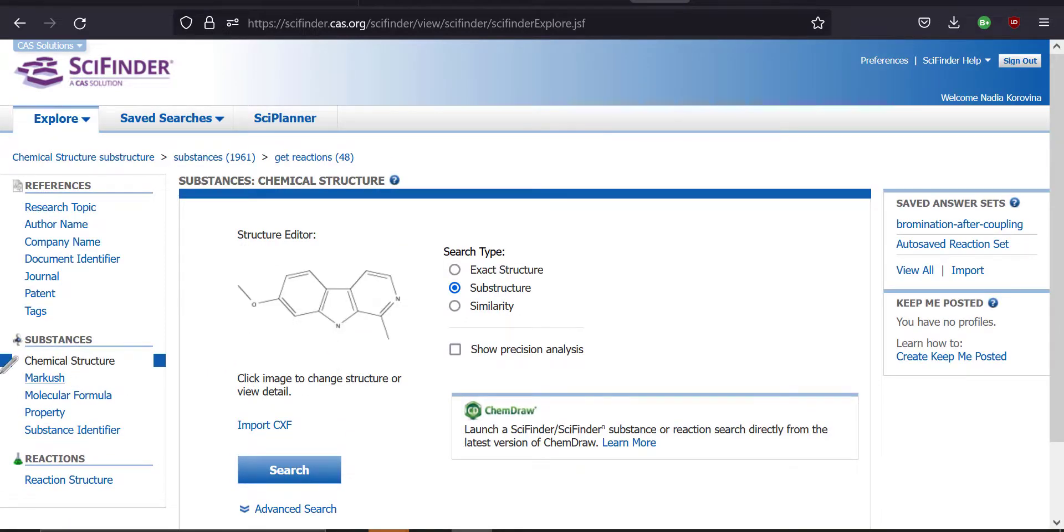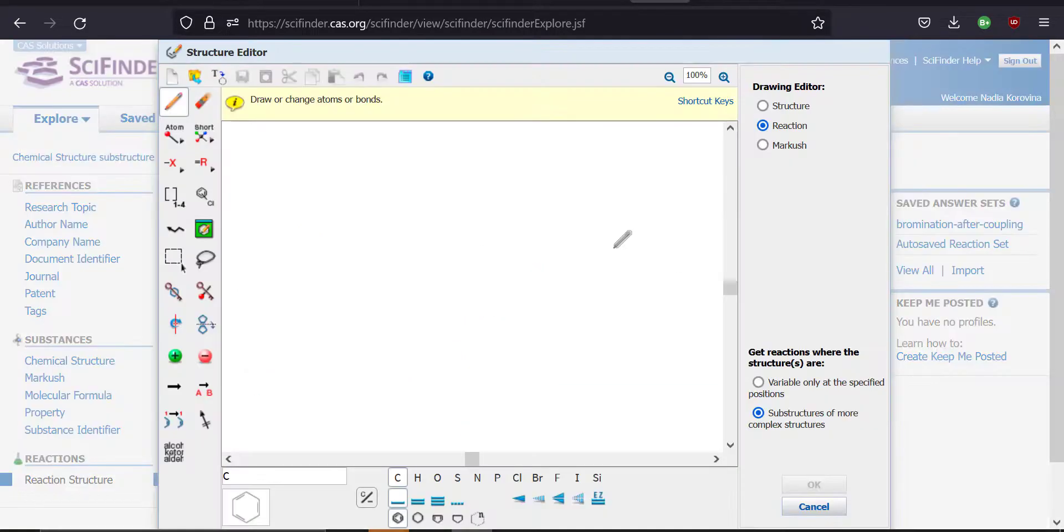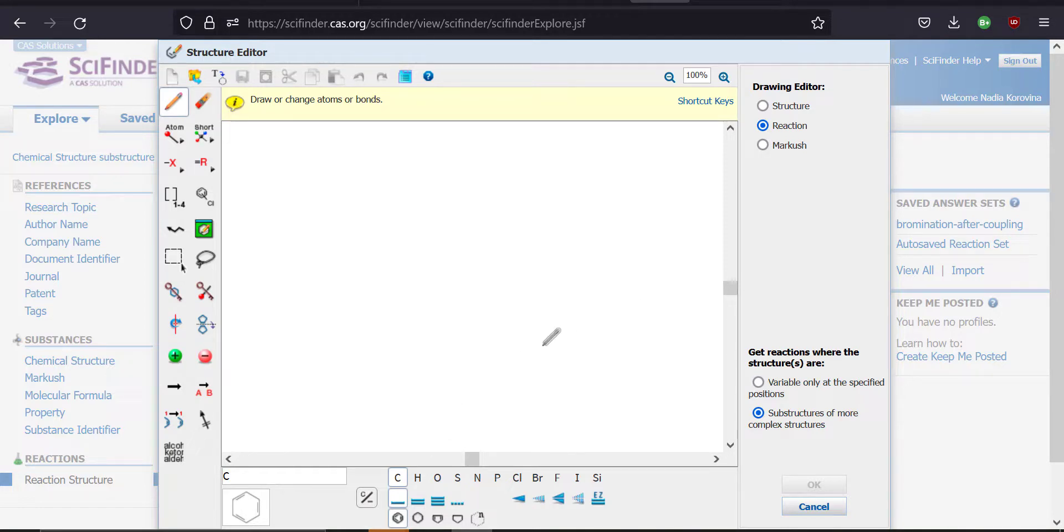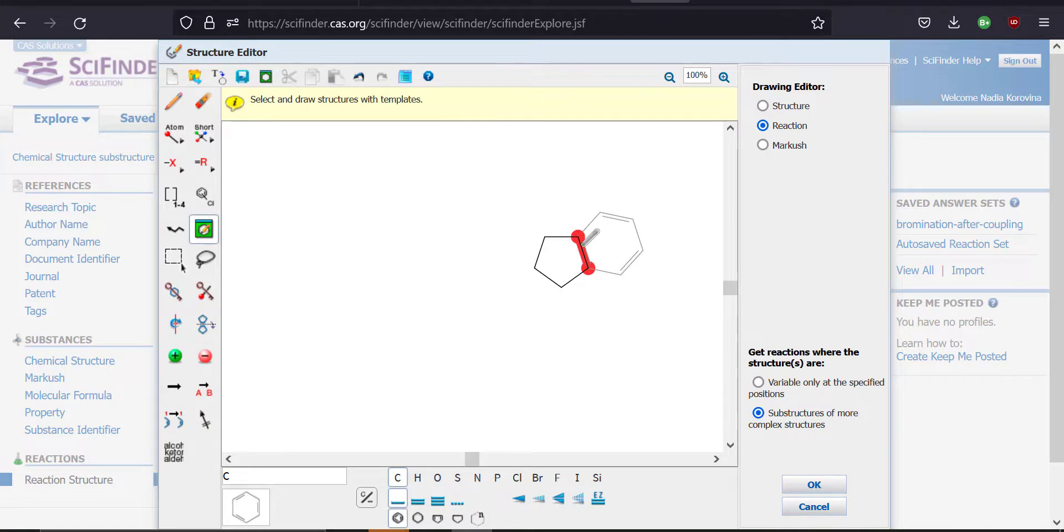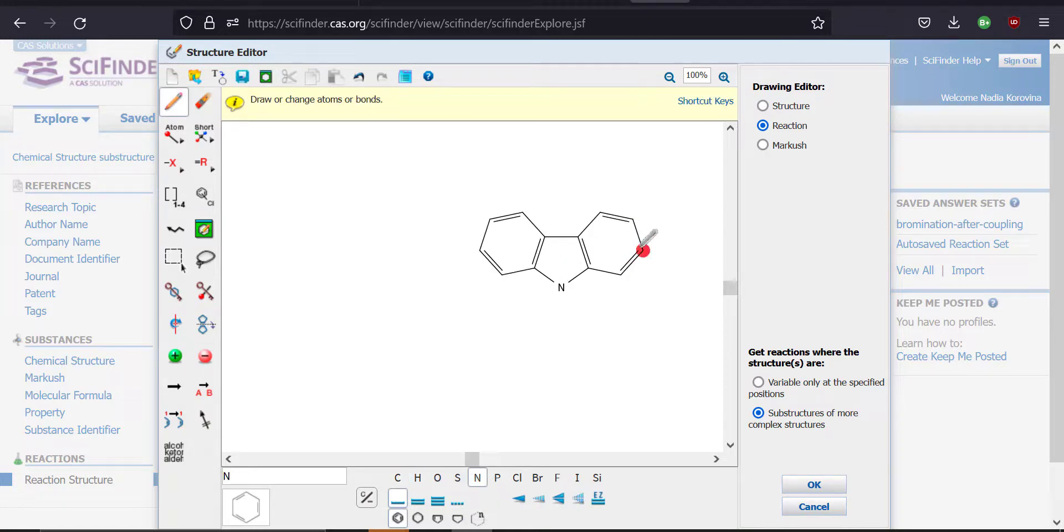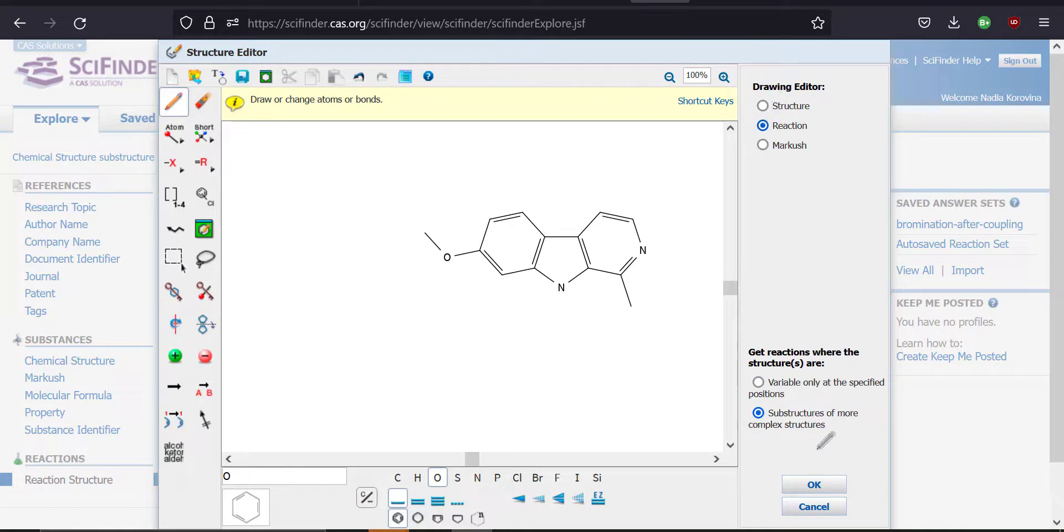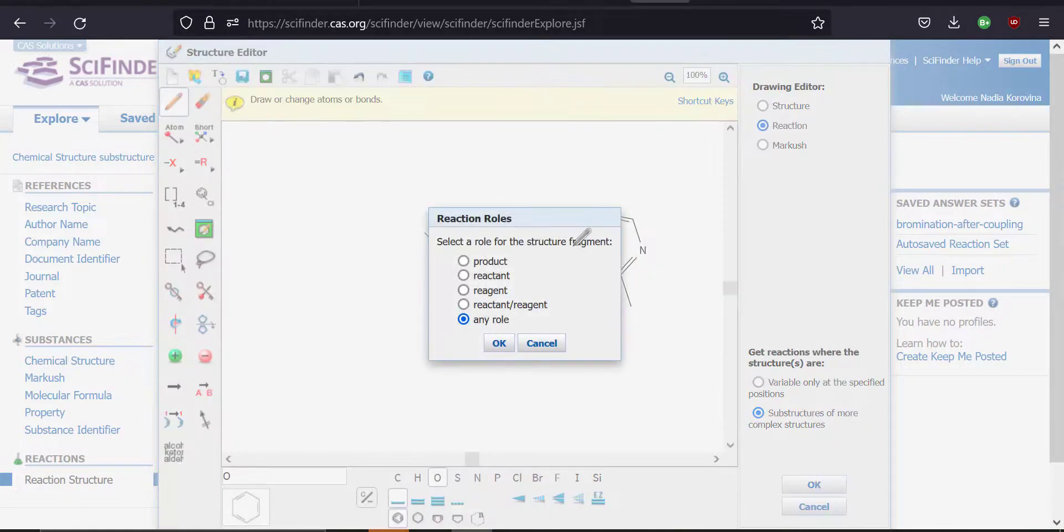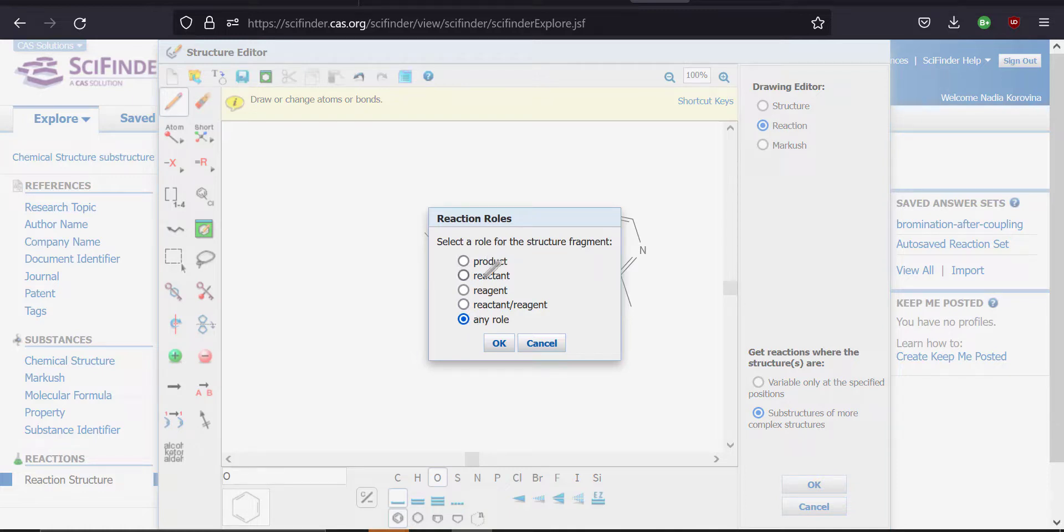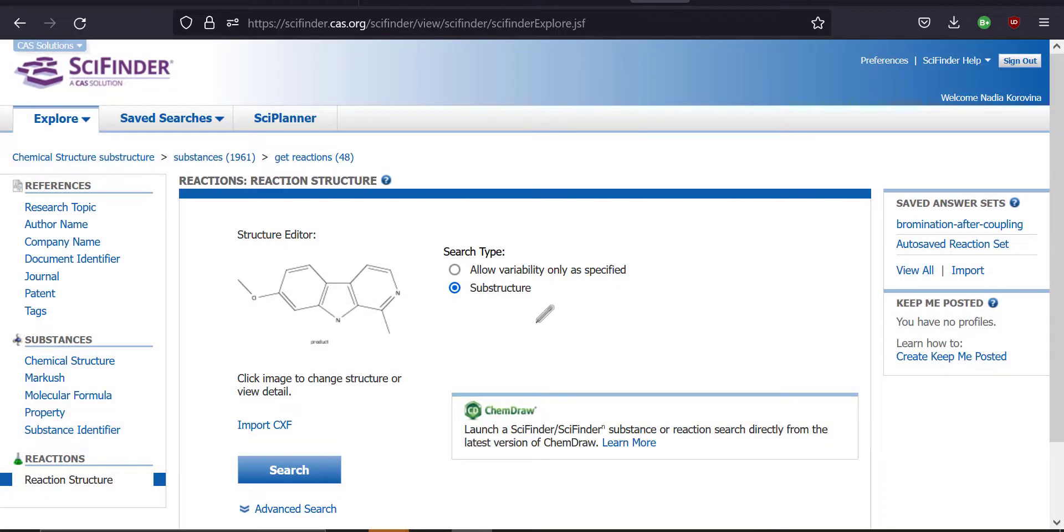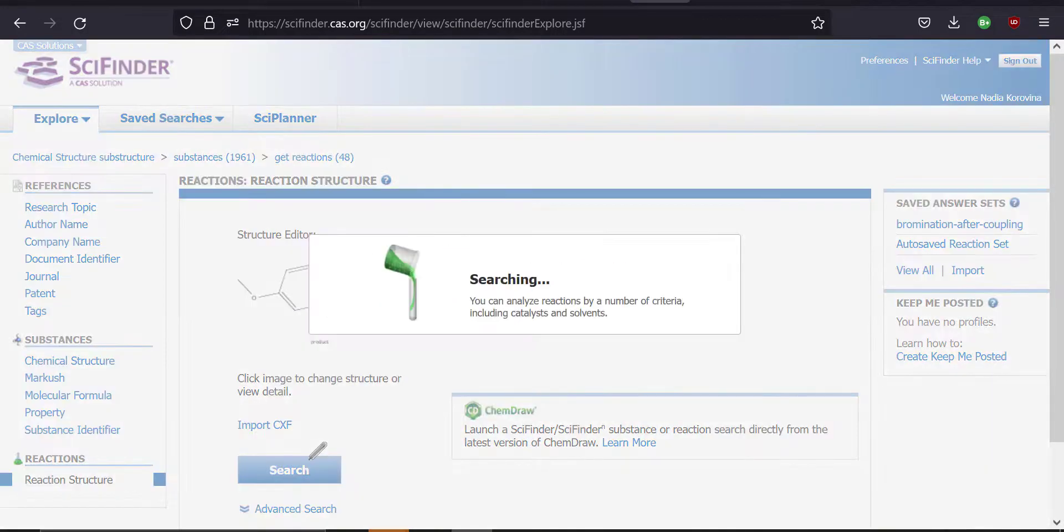All right. So now instead of searching for the substance, we're going to search for reactions. Here you can search for very specific reactions, like starting with very specific starting materials and showing the products that you want to make out of them. But you can also use this more broadly. Instead of searching using starting materials, you could just search for a product. Let me just draw harmine again. All right. And I'm going to leave off the hydrogen again. Now if you just press okay, while you're in the reaction mode, it's going to ask you, do you want to search for reactions where this is a product, a reactant, a reagent, reactant or reagent or any role. So I want it to be a product. So I'm just going to select product and search.